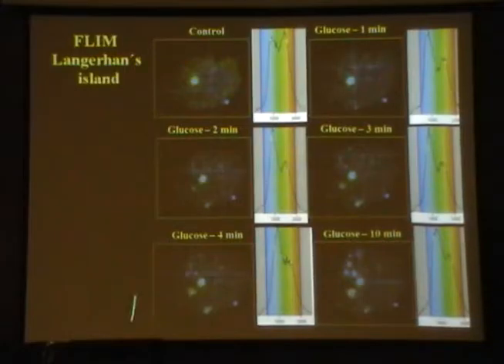living stuff. So we get these Langerhans islets that are inside the pancreas to process sugar. And then what we did is we have the control one here. That was made at room temperature. They usually should be done at 37, 38 degrees Celsius here. But you see that you have this bright spot here, and then we add a solution of sugar, and then you see it starts to, let's look at the histogram here.